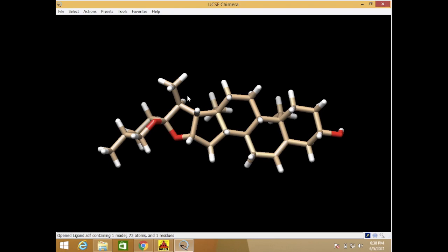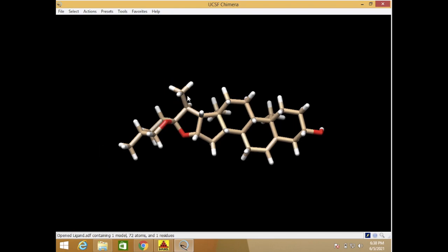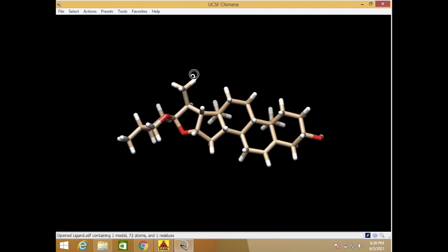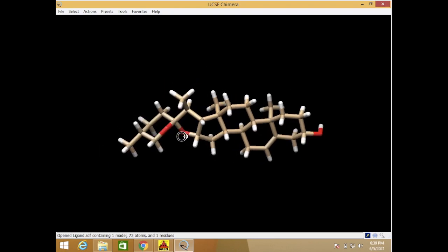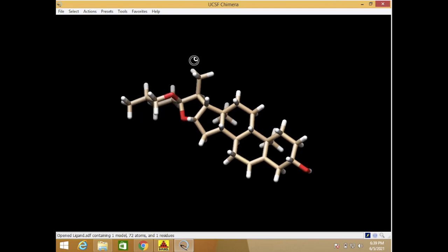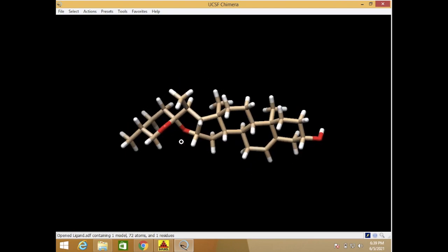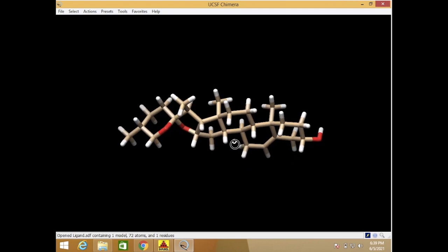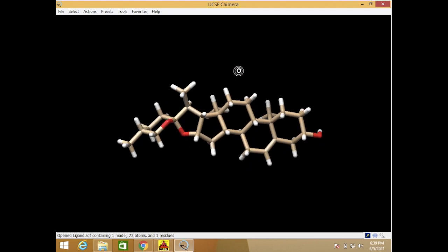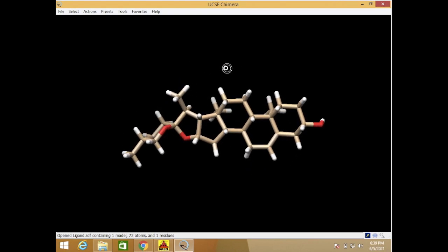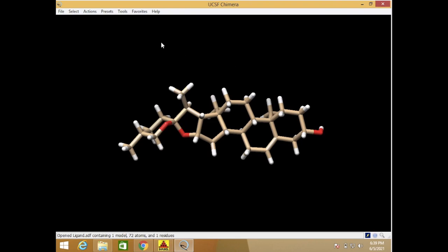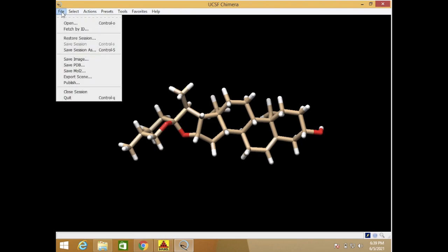Okay, this is our file. As you can see, this is our ligand in 3D. We want to convert the SDF file into PDB, so just click the file here. We save as PDB. It's so easy.